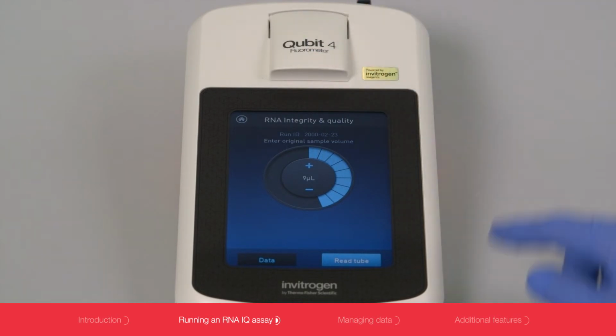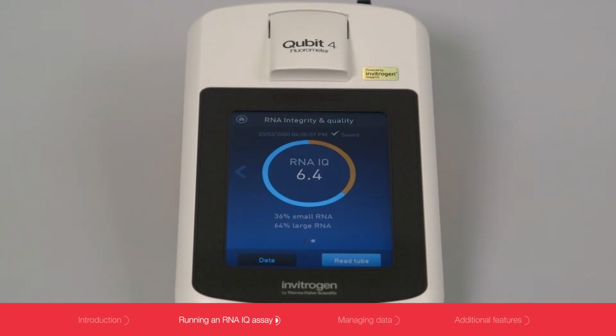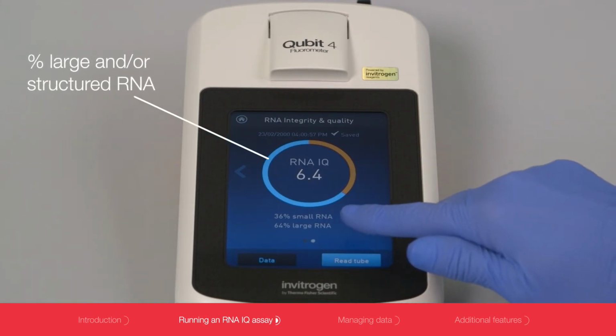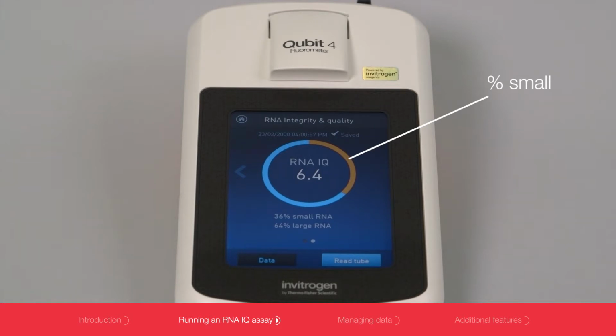The instrument will calculate the amount of viable RNA in the original sample tube. No further calculations are required. The RNA IQ Score is prominently displayed. This value is calculated from the % large and/or structured RNA and % small RNA detected in the sample. The coloring of the circle around the RNA IQ value corresponds to the % large and small RNA.